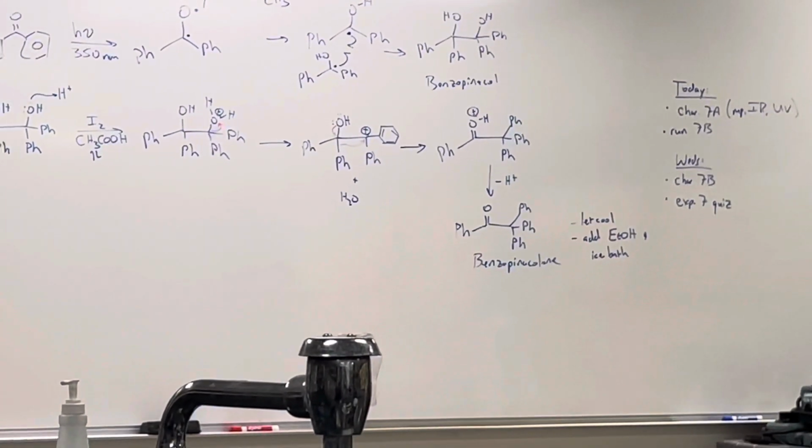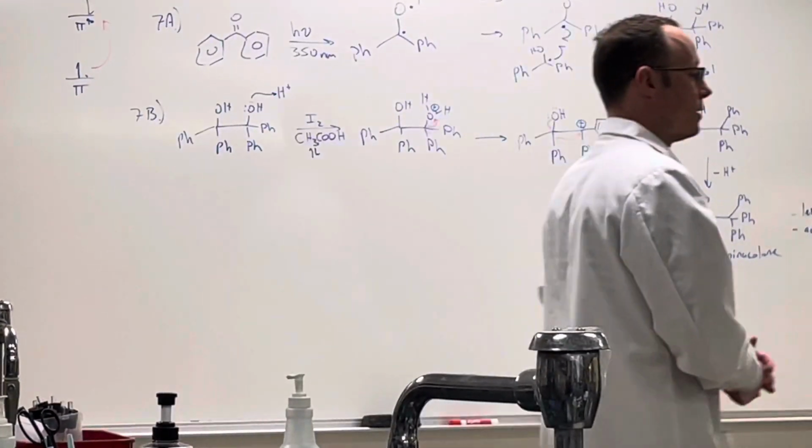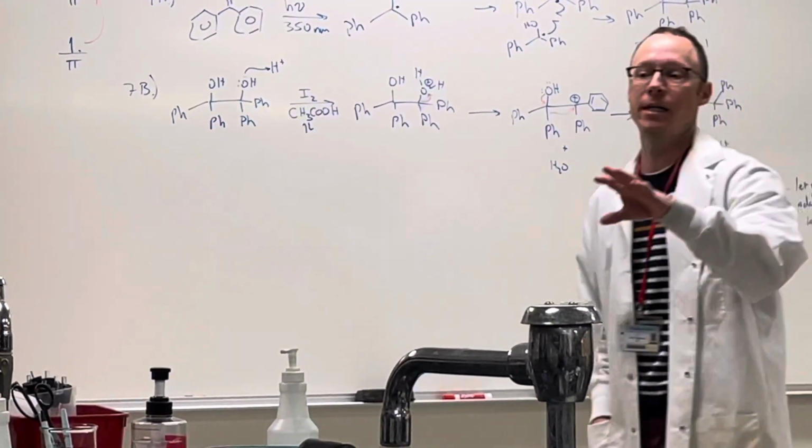All right. If nobody has any questions, then you can go ahead and get started. The Pyrex tubes are up here. You can grab those, and I'll set some iodine out by the balance.